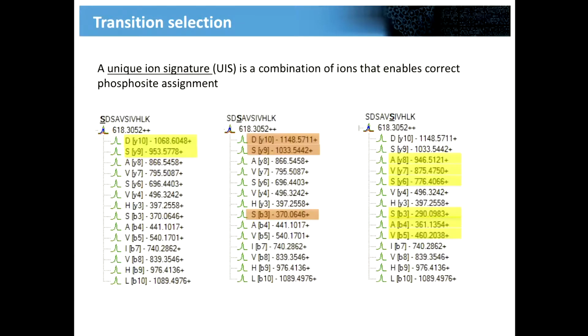but we can try and look at combinations of ions. For example, if we would like to localize, these ions are shared with this possible localization, this ion is shared with this possible localization, but if we were to detect a peak that has the combination of all 3, this would potentially indicate that we're looking at this localization as opposed to this one or this one. There are also other explanations that we will look into in a moment.